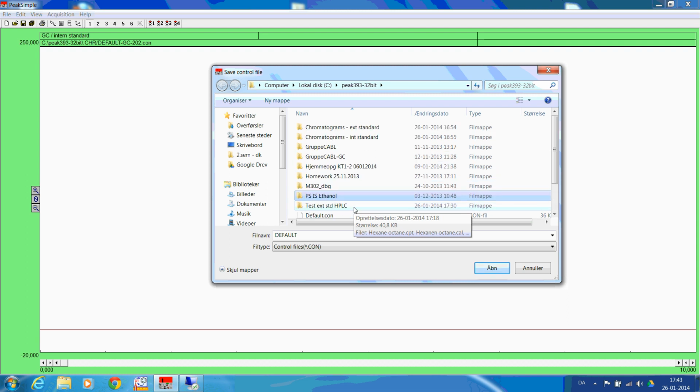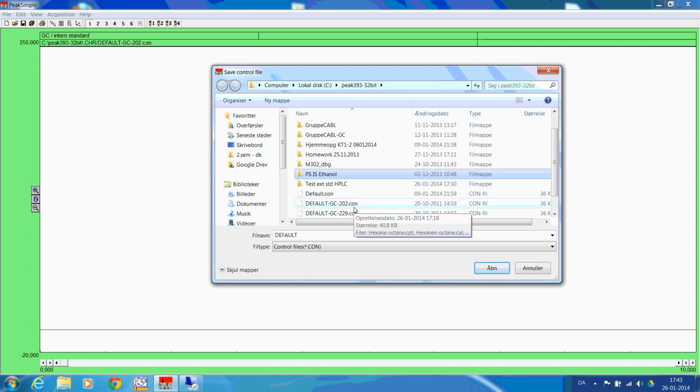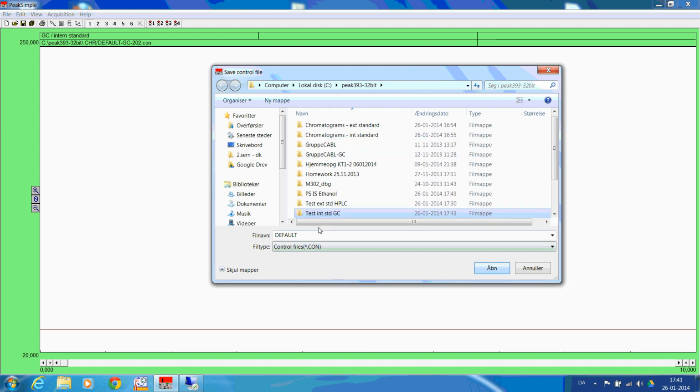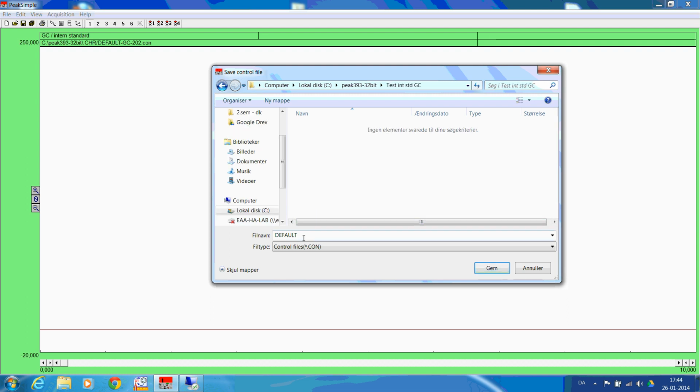Oh, how did that go? Sorry, just try again. There we go.